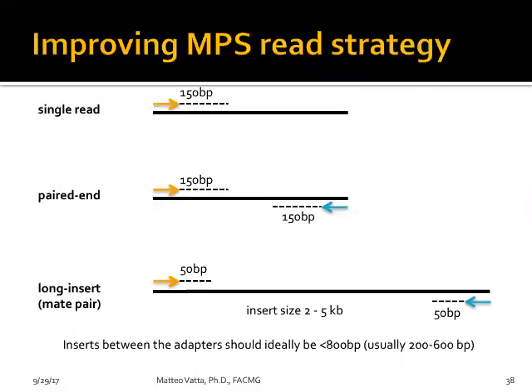Perfect. Thank you. So, as I said before, in addition to the type of capturing modality or the type of machine that you're using, another parameter that is very important for clinical application was the type of sequencing modality, which at the very end was a single read.